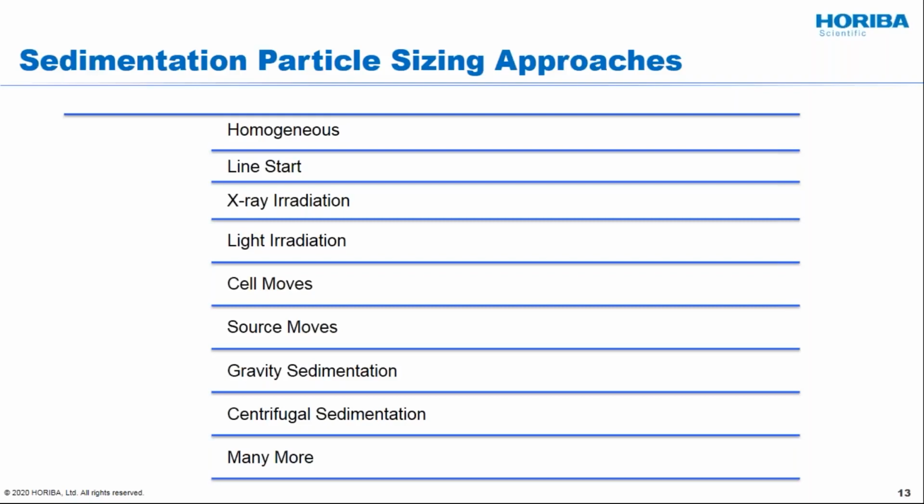So in essence, what you've done is you've taken 1 g of gravity, which is what you have available to you in your laboratory, and you've expanded that into as many as thousands of g's if, again, you have small, low-density particles. So again, I don't want to dwell on this too long here today, but I just want to give you some idea that this is a pretty complicated field.